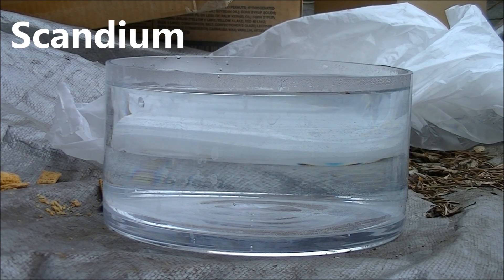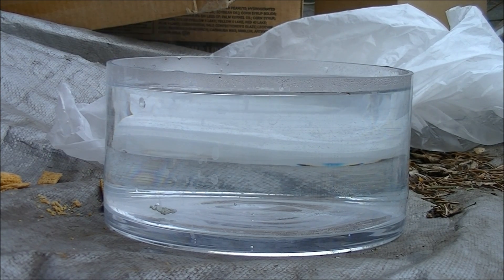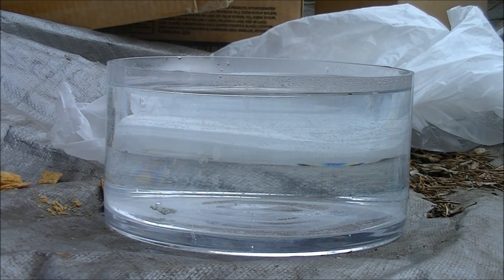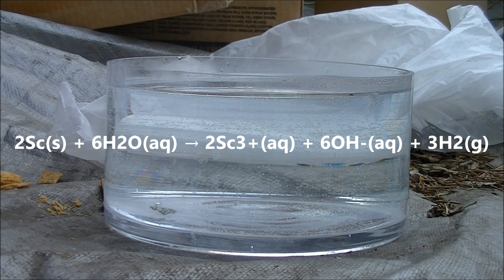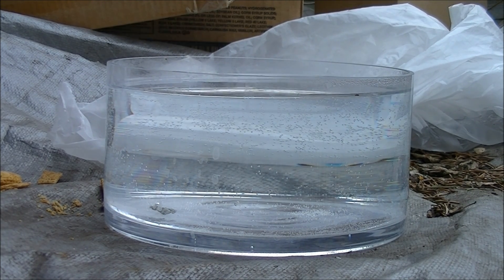To start off, here's scandium. The first of the transition metals, scandium is not very exciting to watch in water. In fact, some of you who saw the alkaline earth metals video might be getting some beryllium flashbacks. However, it does react just enough with water to form tiny amounts of scandium hydroxide and a little bit of hydrogen gas.